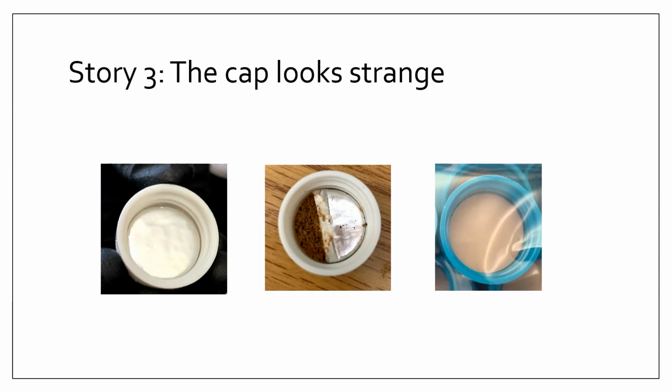On that day, I opened it and looked at the lid, and I started seeing the brown lining. I was like, weird, it should not be that. The lining had dissolved into my solvent. No wonder I had a weird contamination problem.